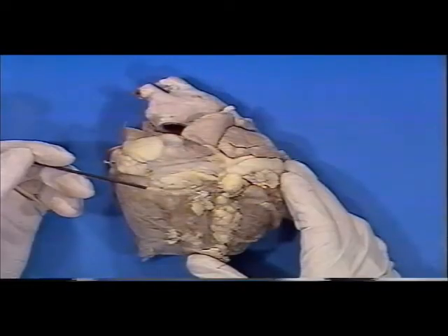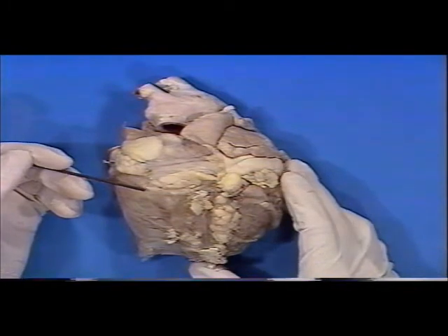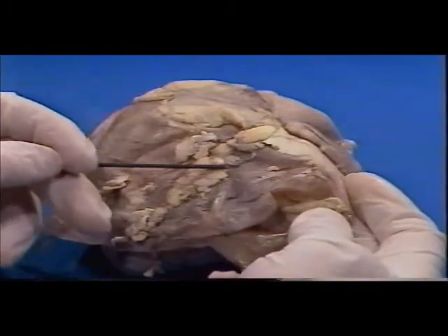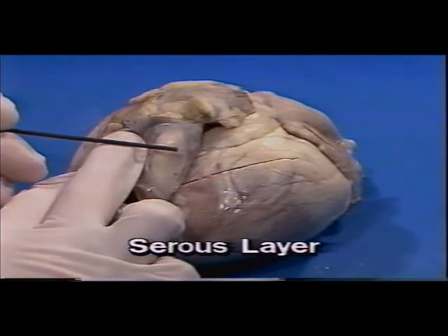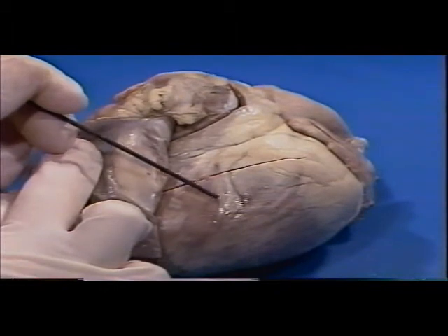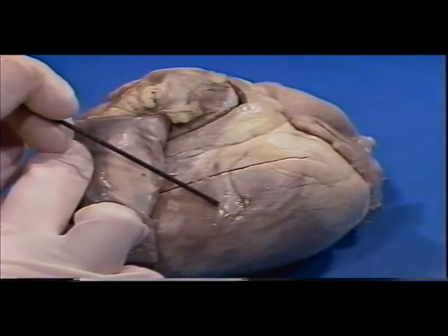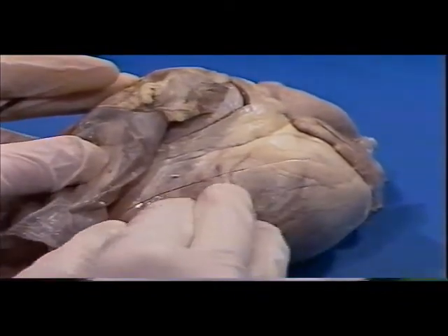You should now place the heart specimen in front of you. If it has a pericardial sac, you should remove it at this point. Note that it has an outer fibrous layer and an inner serous layer. You will see that the surface of the heart, again called the epicardium, is smooth and glistening. The bulk of the heart consists of the cardiac muscle, the myocardium.